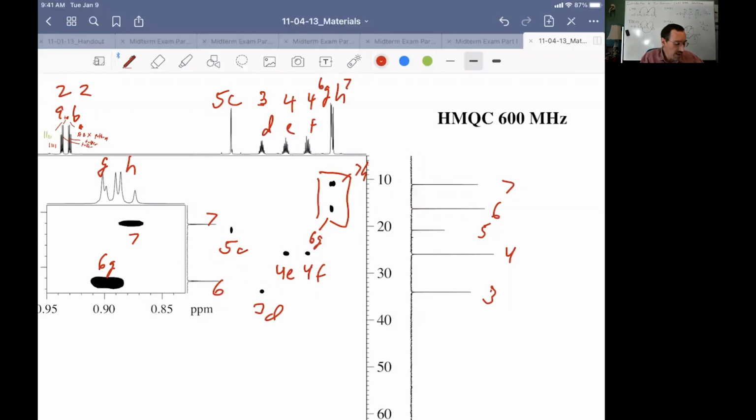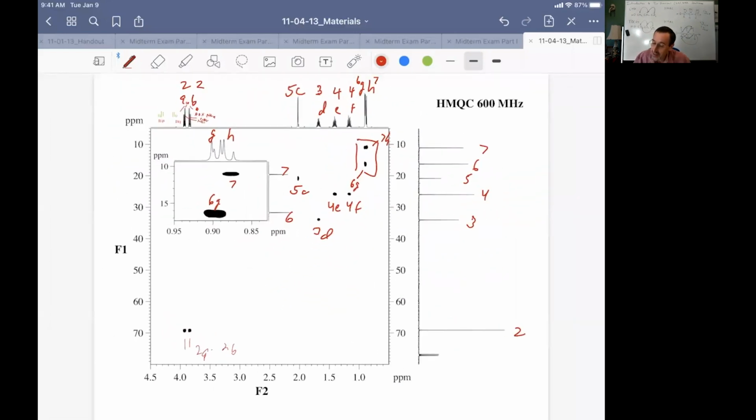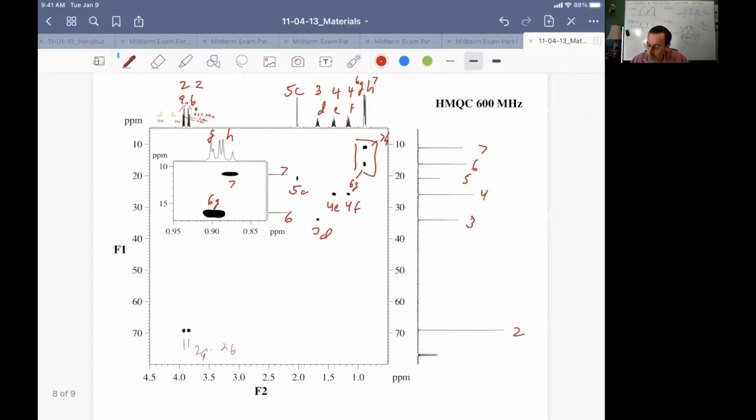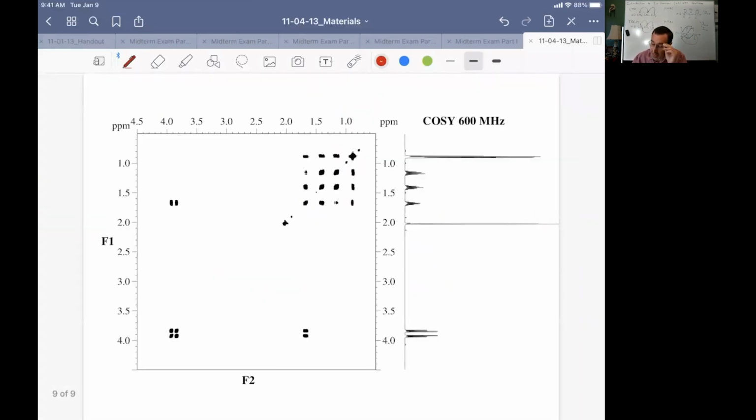All right, at this point, now we're ready to build up our molecule and use the COSY for this, and I'll show you how we do that. So at this point, again, very slavishly, I'm going to transcribe things. We will normally plot both spectra along the axes. Here, for the sake of convenience, they've only plotted one, but we will typically plot the proton spectrum on both axes. Remember, this spectrum doesn't come from the 2D spectrum, although you could plot it from the 2D spectrum, but it's kind of ugly. We do a separate 1D spectrum and superimpose it.